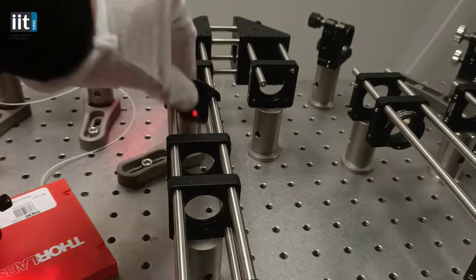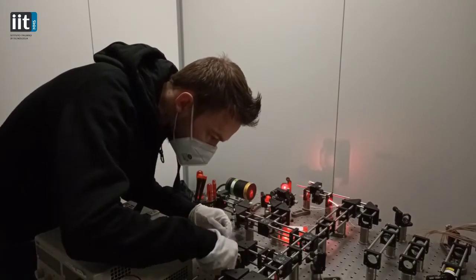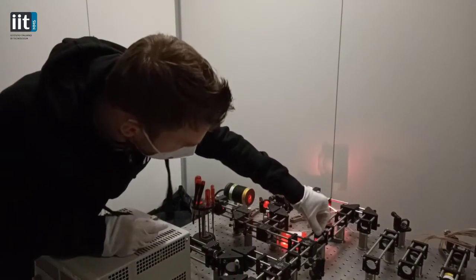Once we know where the molecule is, we can move to the next one, and so on. We repeat this process until we have found the position of hundreds of molecules. Then, in post-processing, we can use this information to build an image.